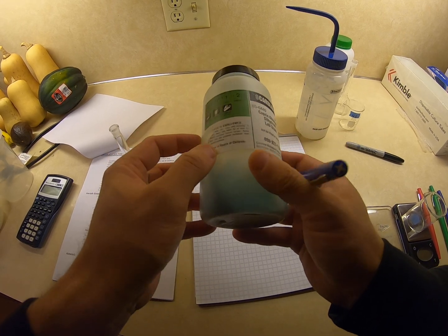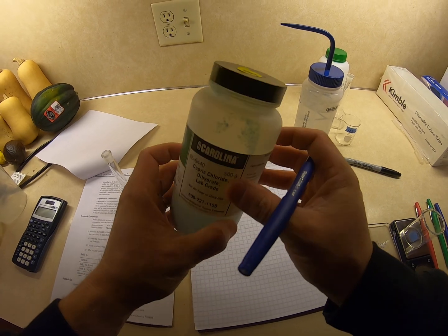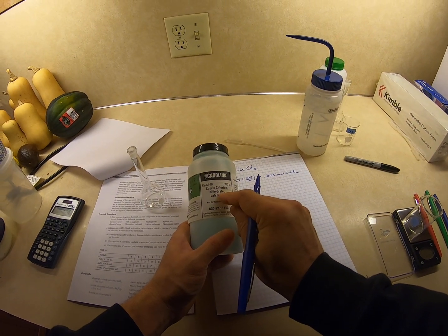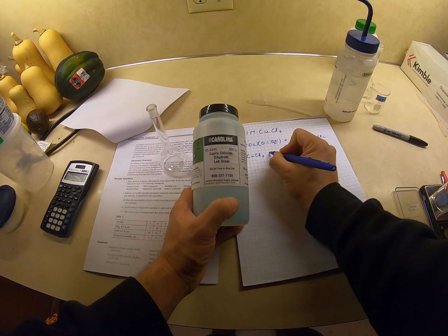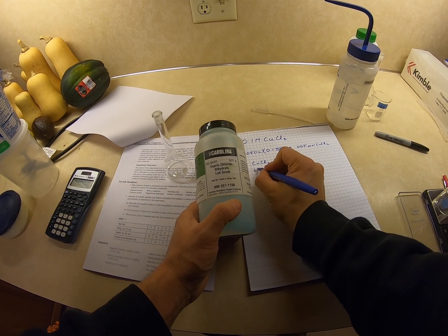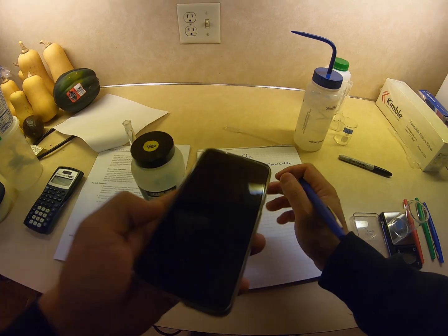And I know that the molar mass, the formula weight of copper(II) chloride, let's see if I can find it on here. It's not given on this label, so we're going to calculate it. Now it's cupric chloride dihydrate, so that means it's got 2 water molecules, so CuCl2·2H2O. Okay, so I need to look up the molar mass of all this. I think that's 63.5 plus chlorine.